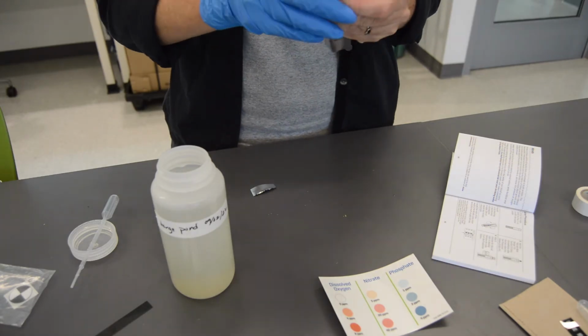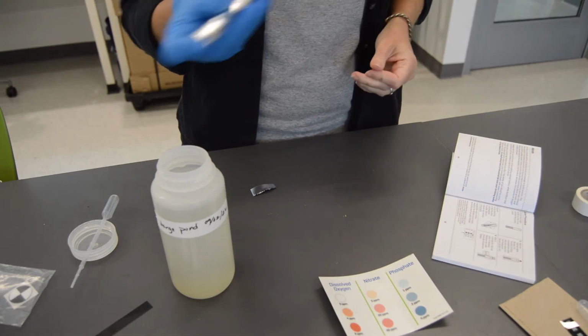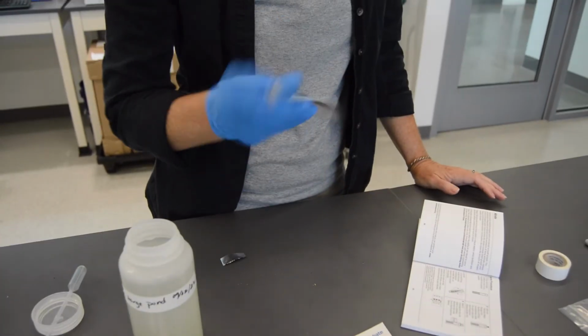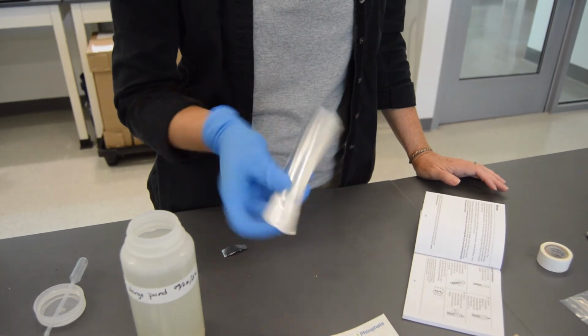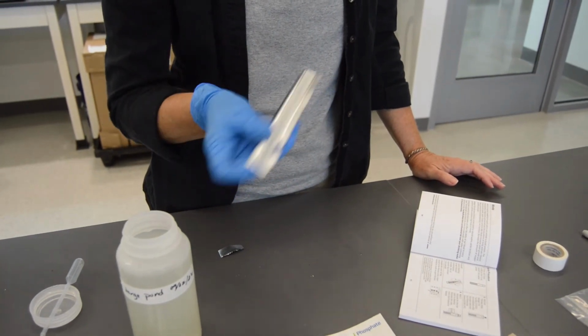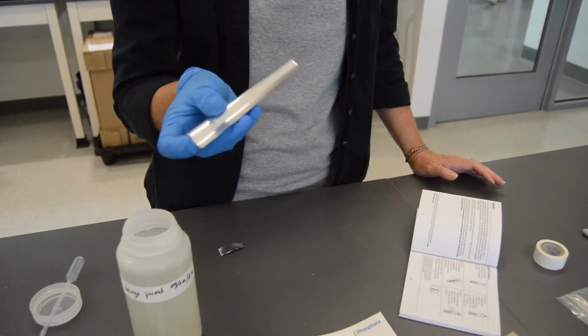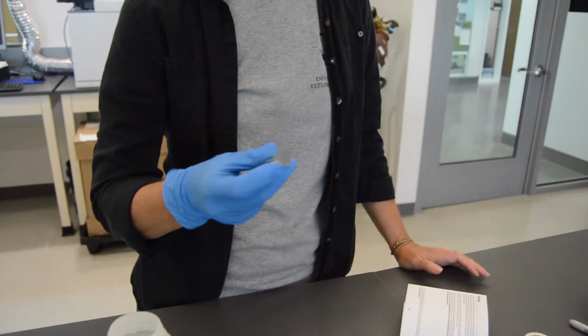So I'll slide our tube in there. And then we're going to shake it to dissolve the tablet. And this takes about 2 minutes. And then once this tablet is dissolved, we wait for another 5 to let the color develop before we pull it out and expose it to the light. And then we'll compare it to our nitrate chart.